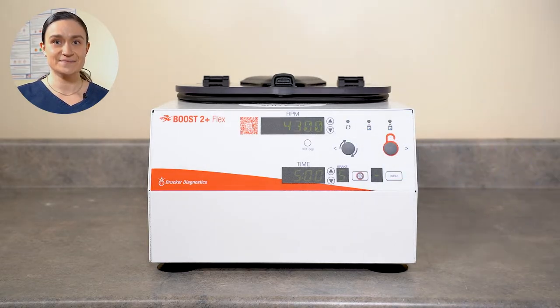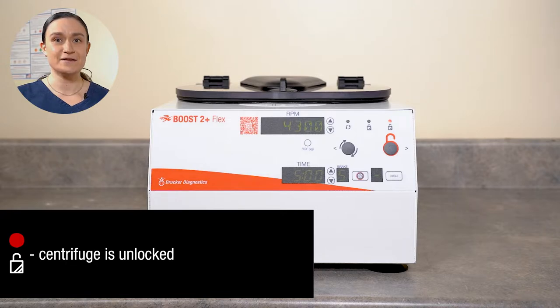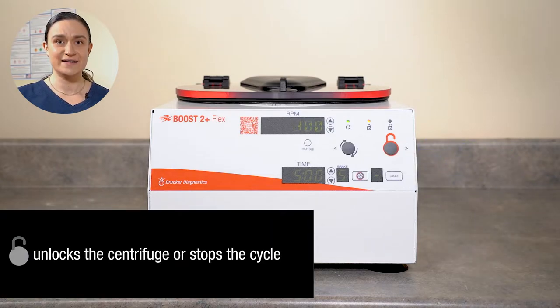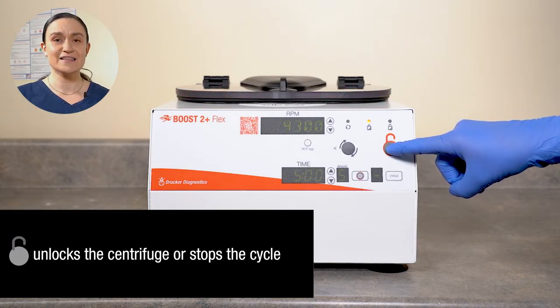Next, we have our indicator lights. The left-hand light is illuminated whenever the centrifuge is running. The center light is illuminated whenever the centrifuge is locked. The right-hand light is illuminated whenever the centrifuge is unlocked. The left-hand and middle lights are commonly illuminated at the same time, as the centrifuge is always locked when it is running. Next, we have our Stop Unlock button. This will stop any currently running cycle, or if the centrifuge is at rest, will unlock the lid latch system.